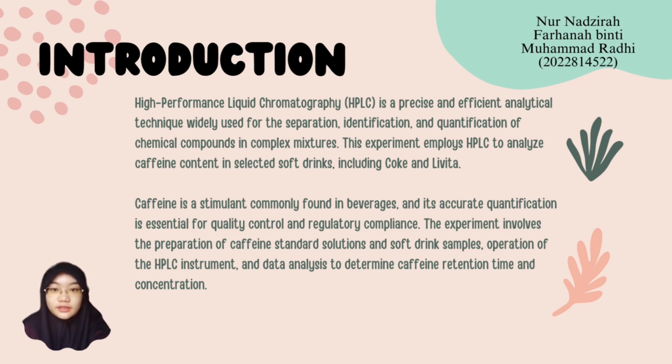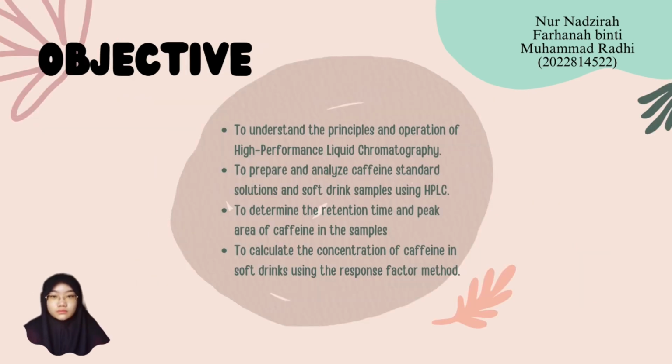In this experiment, we use HPLC to analyze the caffeine content in soft drinks such as Coke and Levita. Caffeine, a naturally occurring stimulant, is commonly found in beverages and requires precise quantification for quality control and regulatory purposes. By preparing caffeine standard solution and soft drink samples and operating the HPLC instrument, we determine the retention time, peak area, and concentration of caffeine in these beverages.